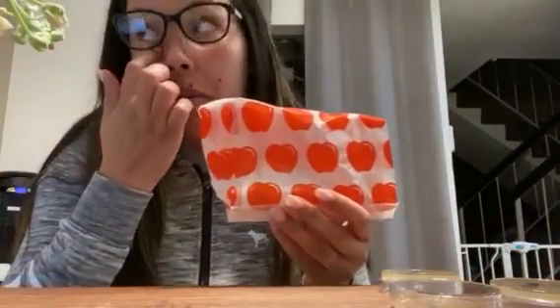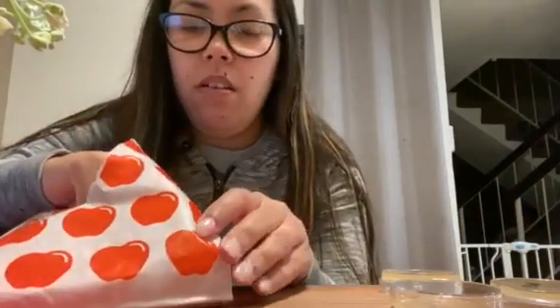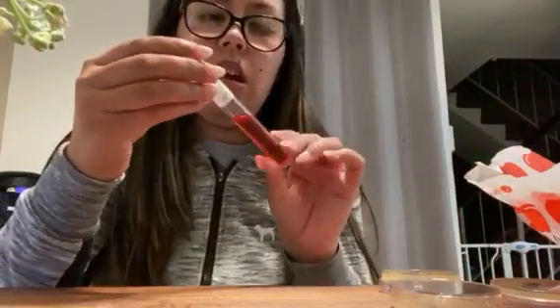So in the first part of the exercise, I demonstrated the part where I got the cultures in the broth, and I have them in my bag here from the refrigerator from a couple days before, just preserving them. So we have E. coli, S. epidermidis, and the S. cerevisiae, the yeast one.